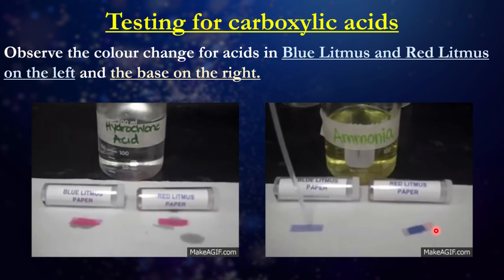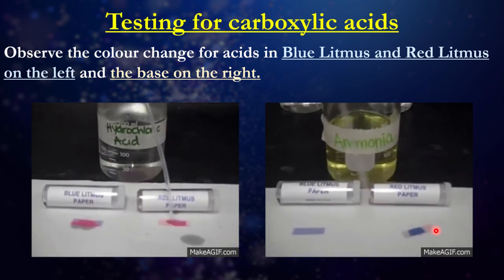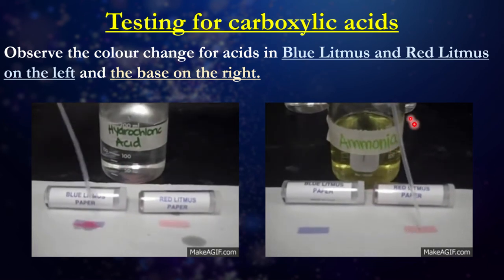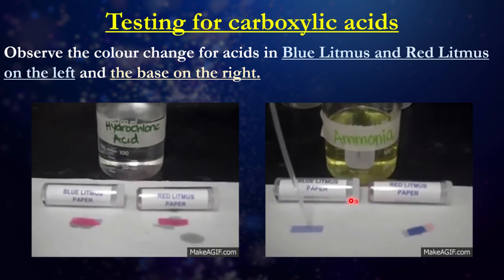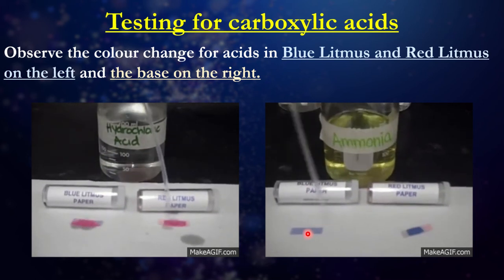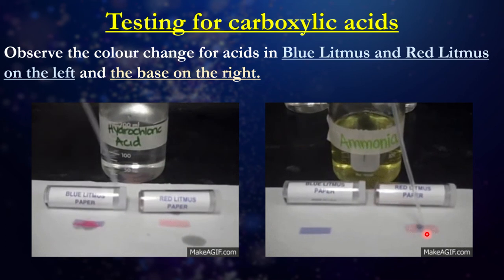If you compare the pair, obviously we don't have the carboxylic acid example, but it goes through the same way. So ammonia is a known base. If it reacts with blue litmus paper, it will stay blue. If it reacts with red litmus paper, it turns blue.